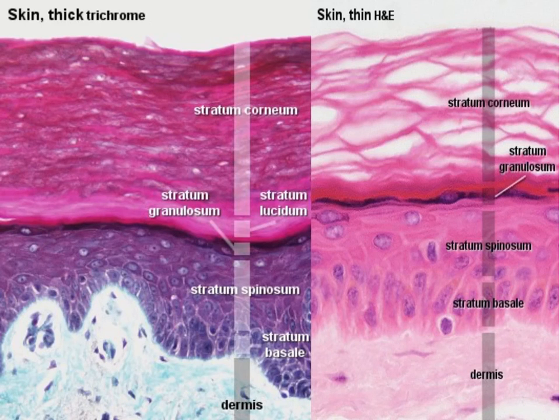So here we can see a close-up of the epidermis. Again, we want you to always find the stratum granulosum. Below the stratum granulosum, we will have the stratum spinosum, the 1 cell layer that we see that separates the epidermis from the dermis is the stratum basale. Just above the stratum granulosum, that lighter color, is the lucidum, and the stratum lucidum is only on the hands and the soles of the feet. And then we have the stratum corneum.